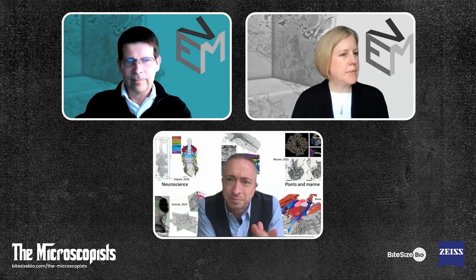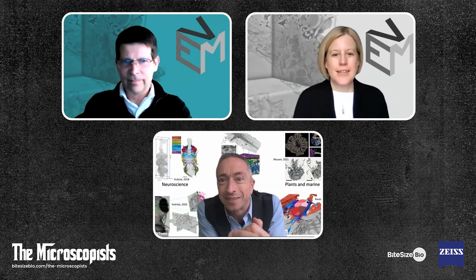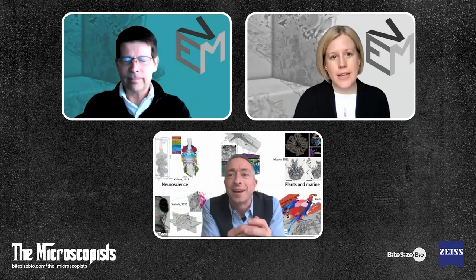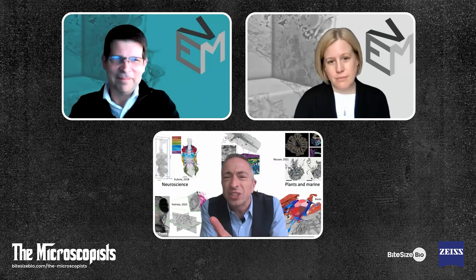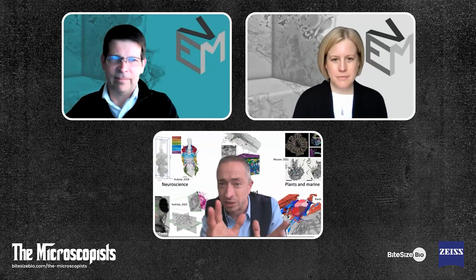It's a huge variety. And so we run around 100 projects a year with 60 teams, and most of them will be volume EM, and each of them will be on something different. The time on the microscope to do this is huge because it's not the fastest experiment in the world. And then the data, we'll come to data later on.